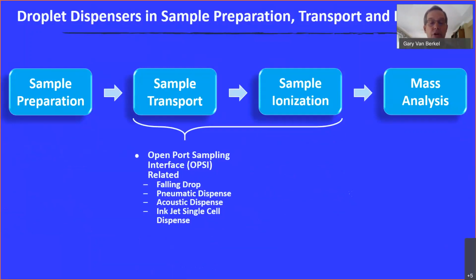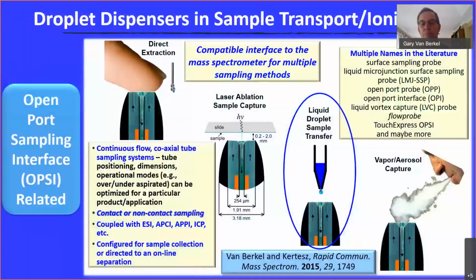Like I said, I'm going to talk today just about droplet dispensers with this open port sampling interface and some new technology that's available that takes advantage of that. So what are these open port sampling interfaces? This is something that I worked on since the early 2000s.